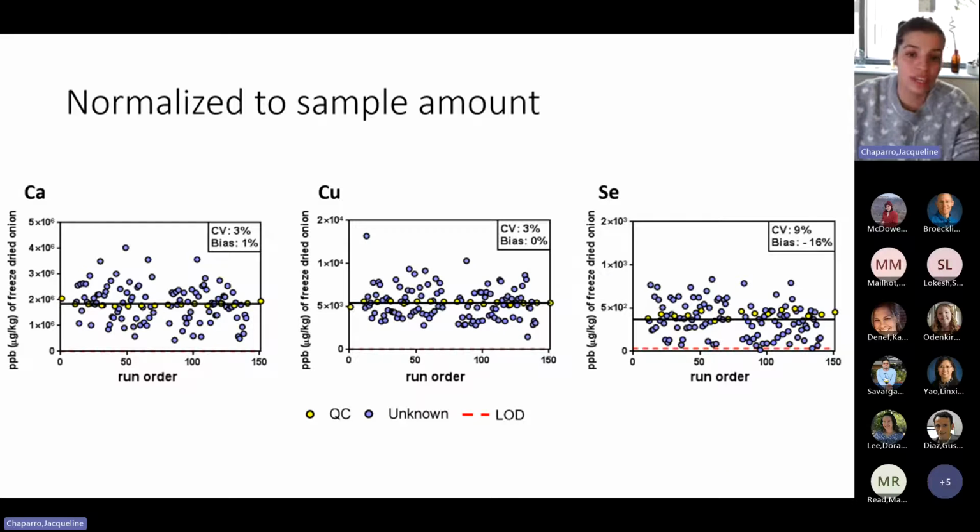And so then you can see how, by taking into account some measurements and some internal standards, we're able to really account for the variability that is present there. That might be instrument error, or even sample processing error, and we can account for those things and really dig down to what is happening in the samples.